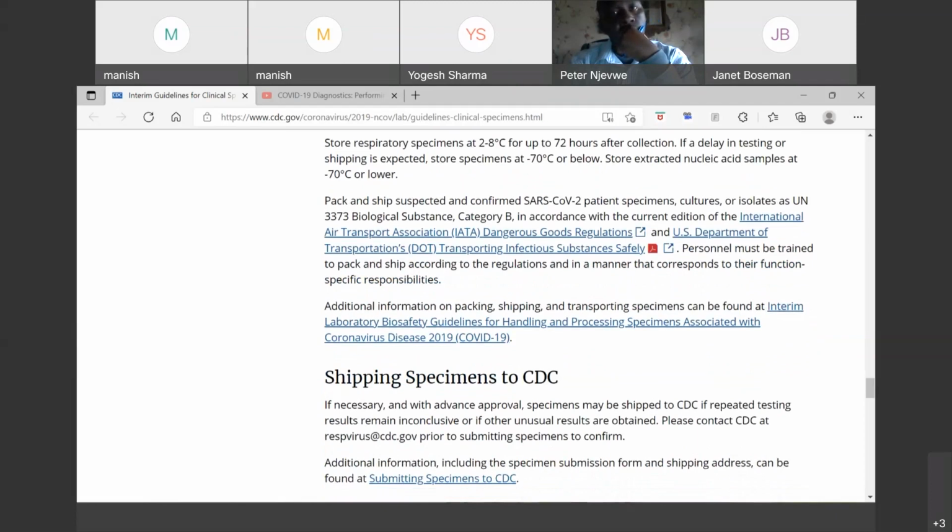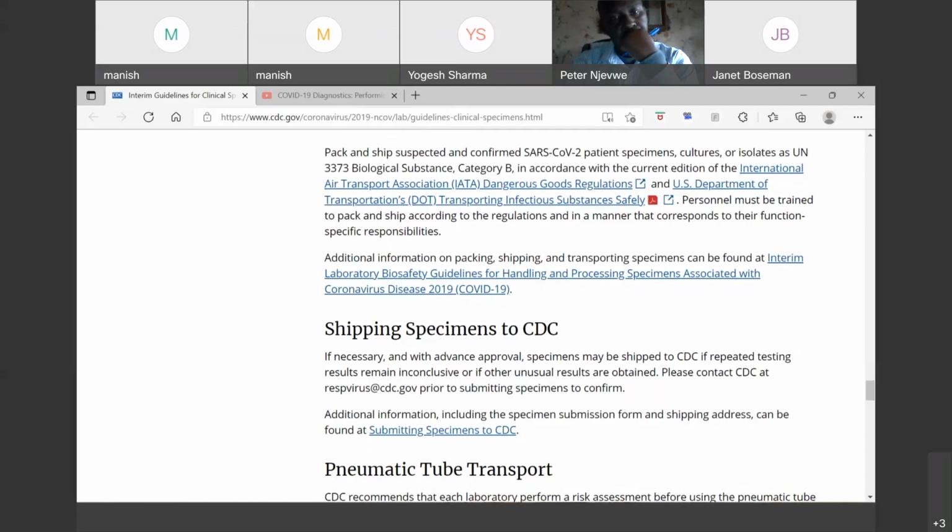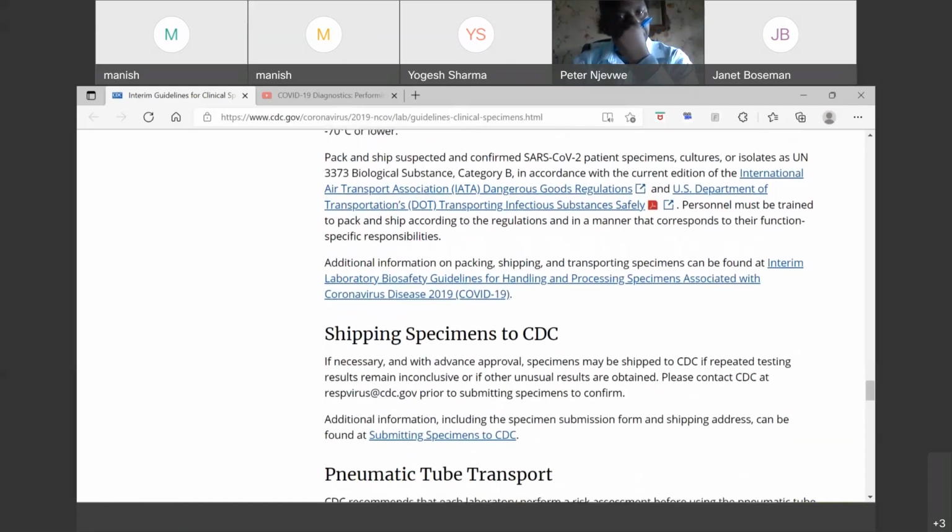Pack and ship suspect and confirmed coronavirus patient specimens, cultures or isolates as UN 3373 Biological Substance, Category B. This is all technical. It is in accordance with the current edition of the International Air Transport Association Dangerous Goods Regulations and the US Department of Transportation regulations on transporting infectious substances safely. These are all the guidance, the norms. Personnel must be trained to pack and ship according to the regulations and in a manner that corresponds to their functions and specific responsibilities.